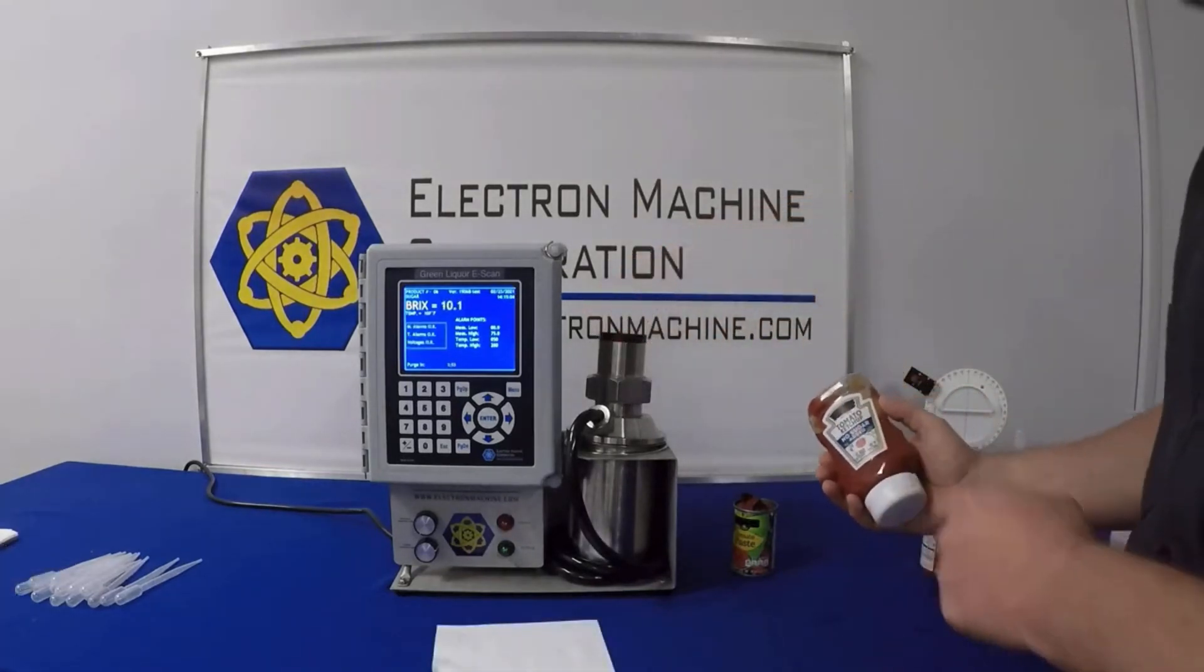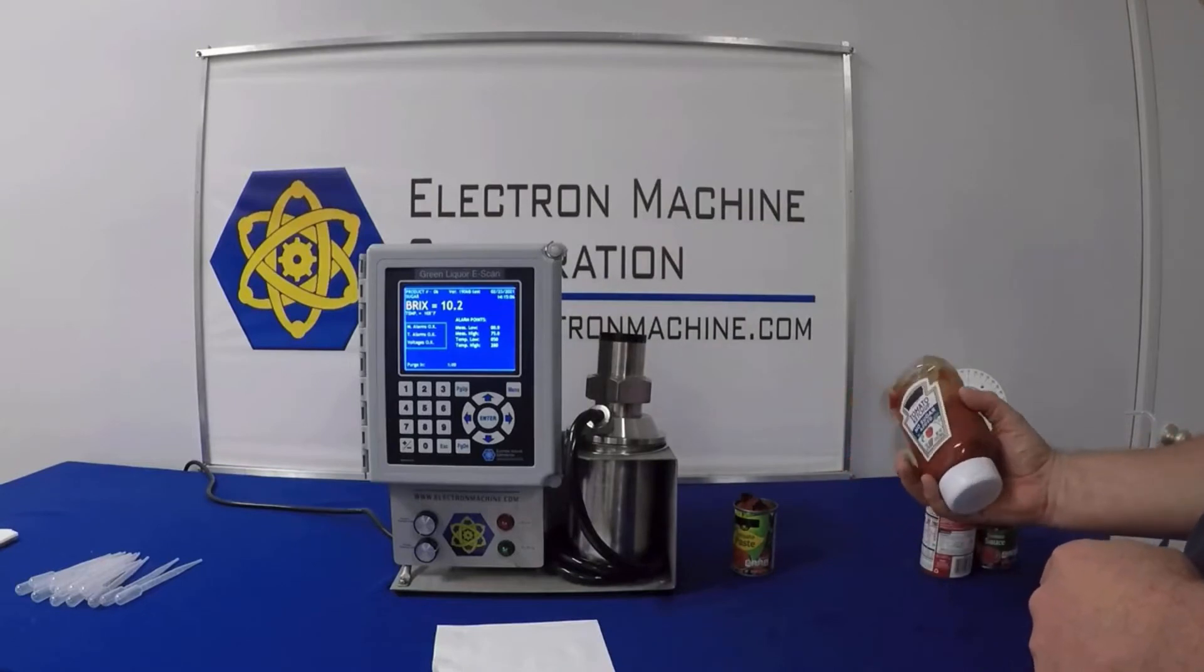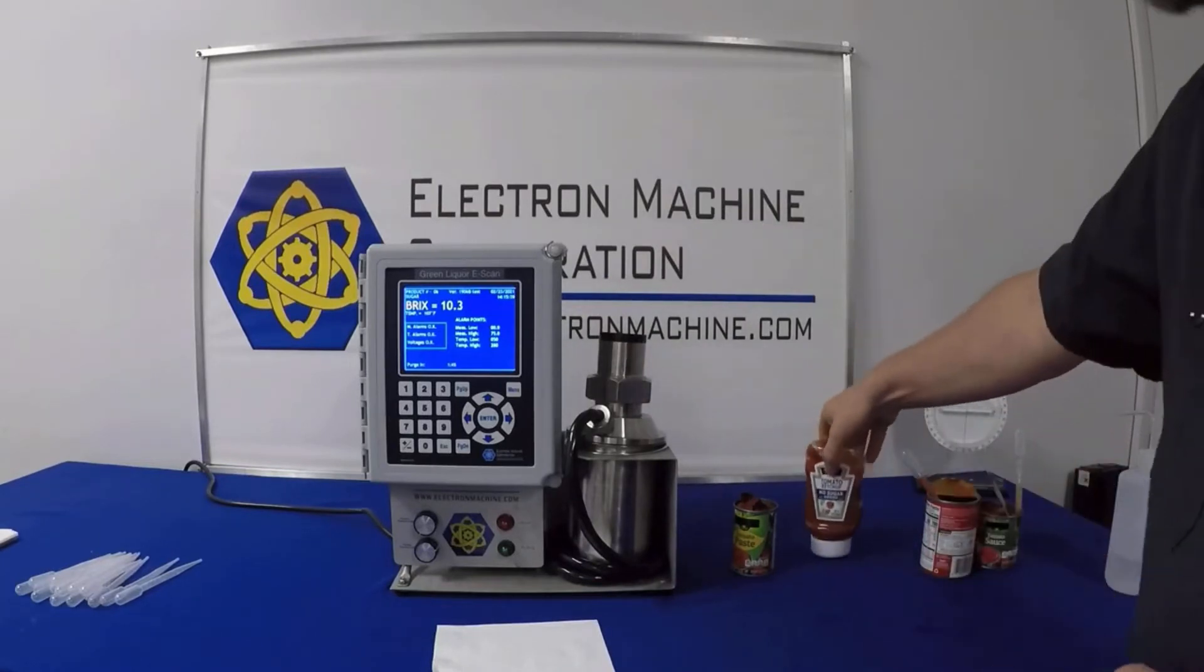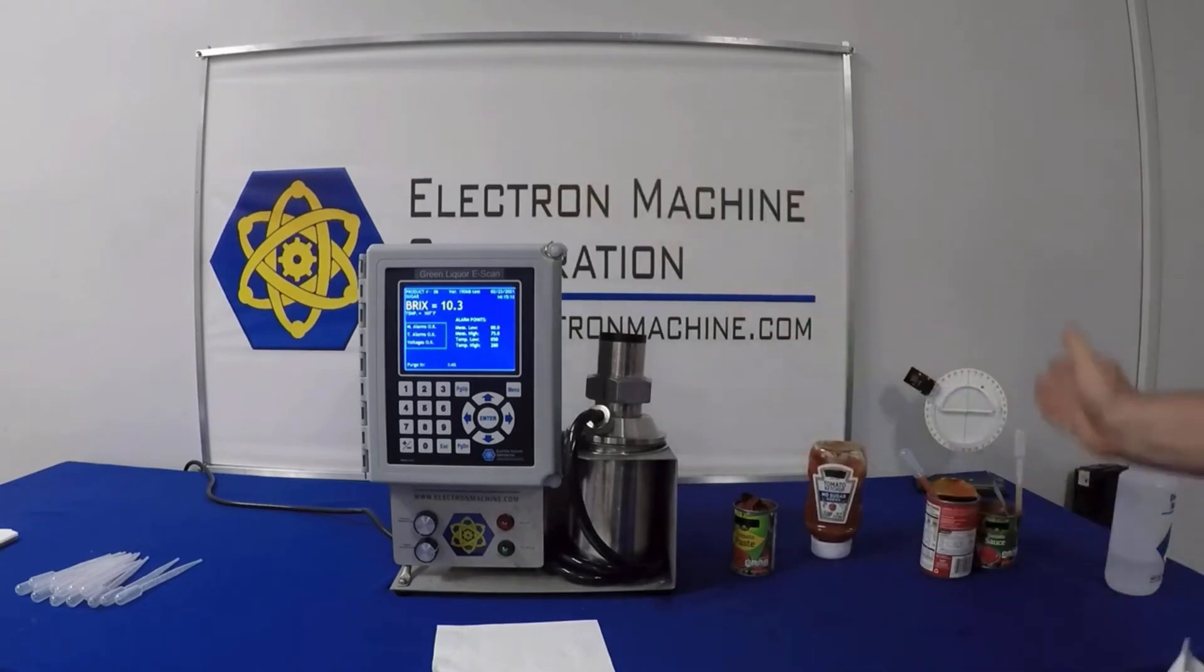This is no sugar added tomato ketchup. As you can see, it does give a different reading. So far we have been able to tell the difference between a condensed soup, a tomato sauce, and a ketchup.